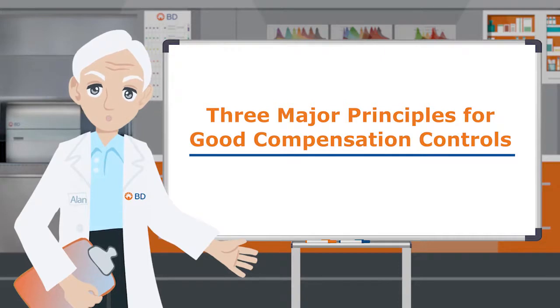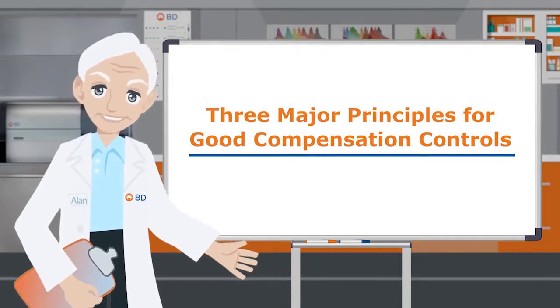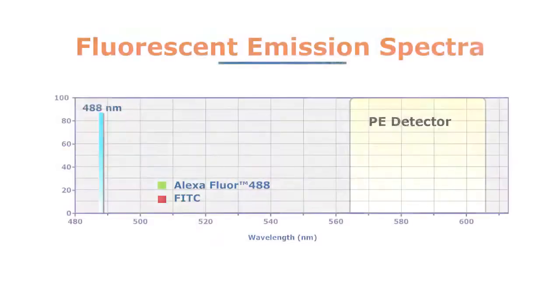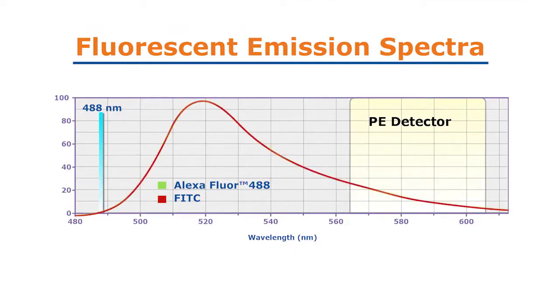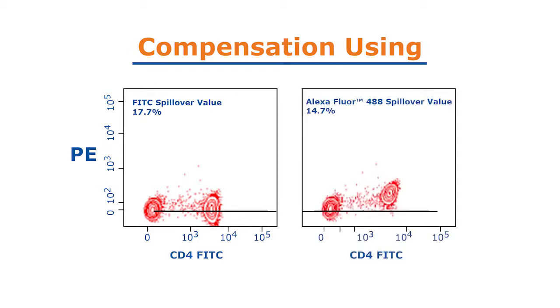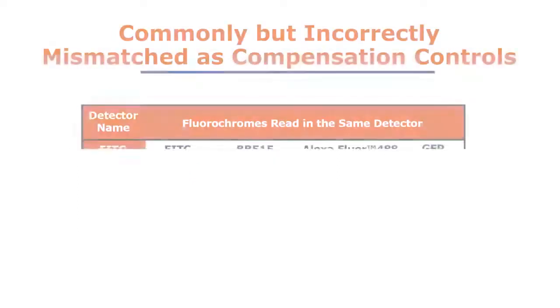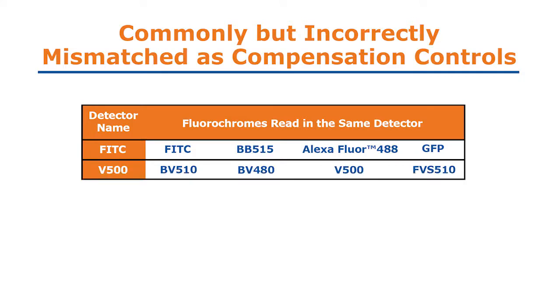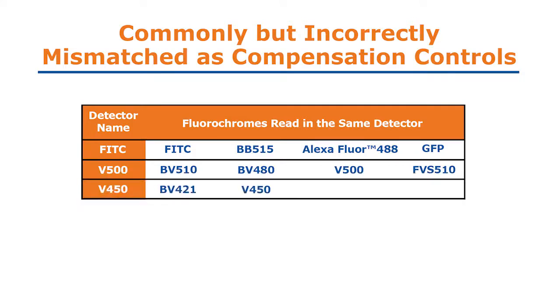First, the fluorescent spectrum of the compensation control reagent must be identical to the reagent used in the experiment. Even similar fluorochromes such as FITC and Alexa 488, seen here, have slightly different emission spectra, which leads to different spillover values. As shown in this example, this means that FITC spillover values are appropriate for the FITC dye, while using the Alexa Fluor 488 spillover values will lead to undercompensation for that same reagent. Here are some other dyes that are read in the same detector and are commonly but incorrectly mismatched as compensation controls.